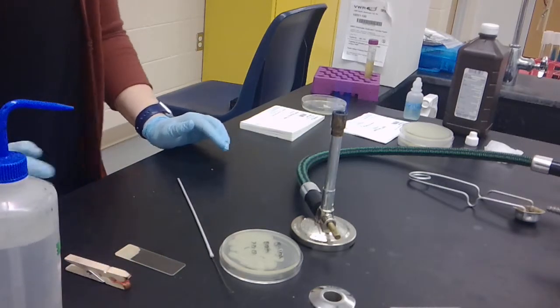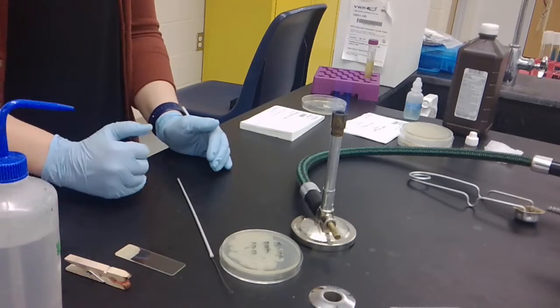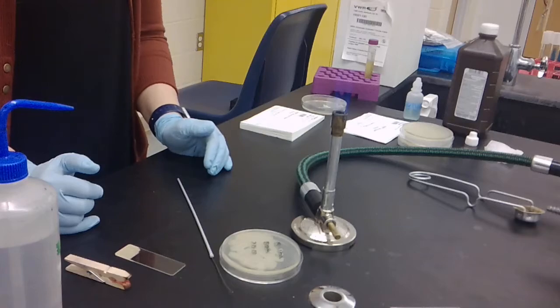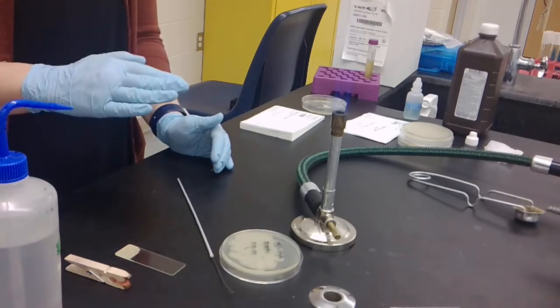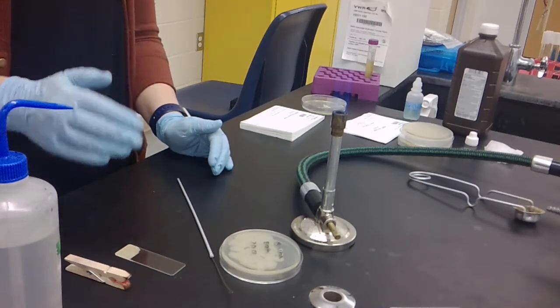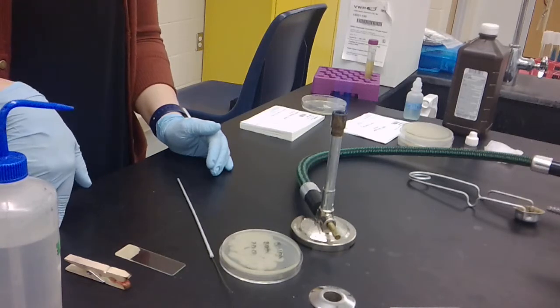In this video, I'm going to demonstrate how to heat fix bacteria to a slide. We will do a variety of different staining procedures in this lab, and for most of these staining procedures, it is important to first make a bacterial suspension on a microscope slide that we then dry to that slide, fixing those bacteria to the slide so that they can then be stained. This is also called creating a smear.